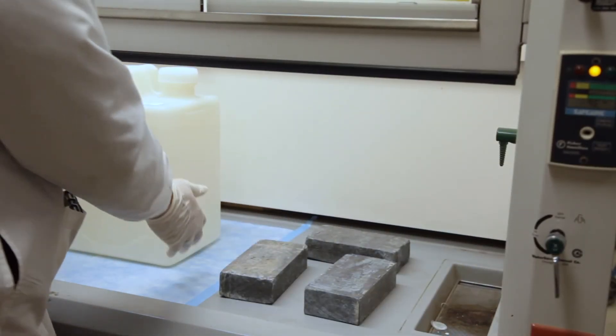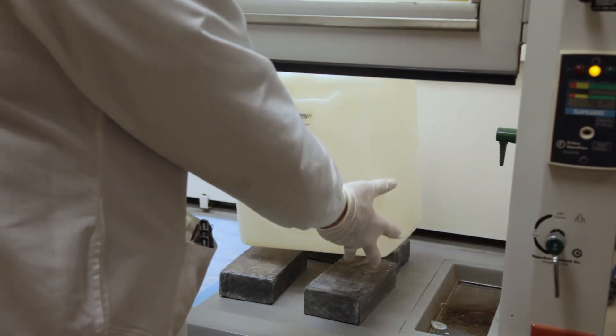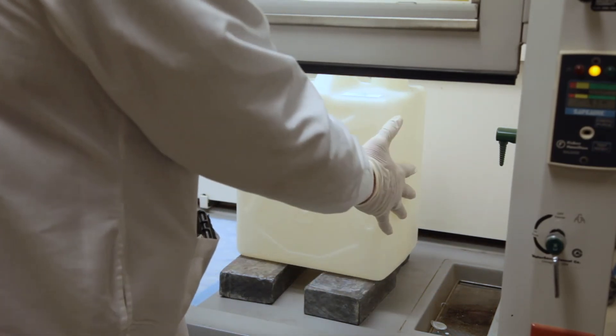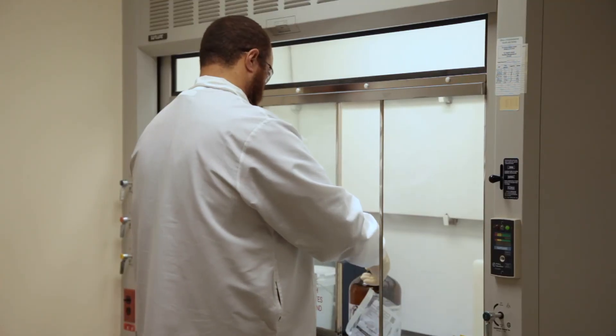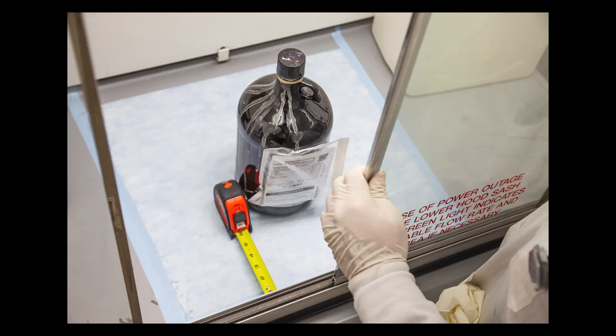Bulky items and equipment can impede airflow and fume hood function. Elevate bulky items 2-3 inches by placing these items on blocks. Work as far back as reasonable inside of a fume hood. It's best to keep all chemicals and equipment at least 6 inches from the face of the hood.